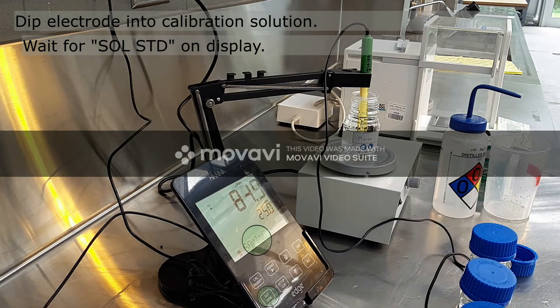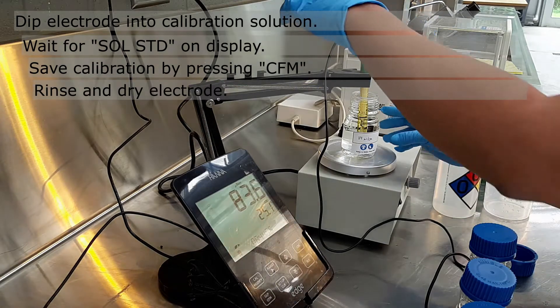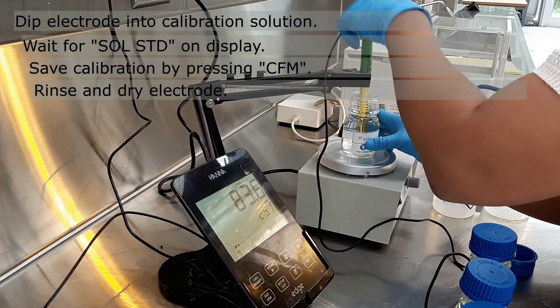Once you see SOL STD on the display, press CFM to save. Then quickly rinse and dry your electrode.